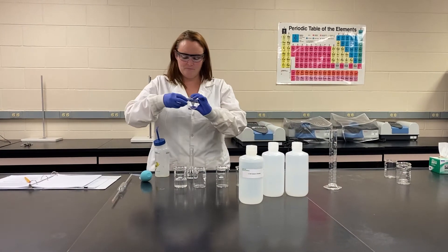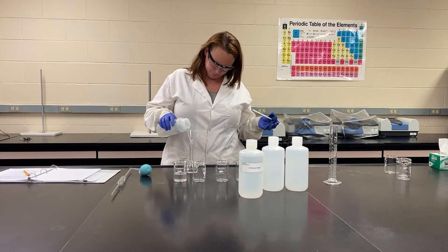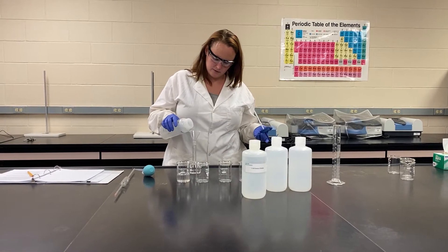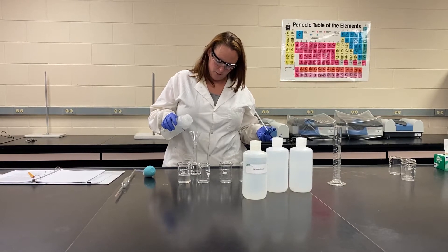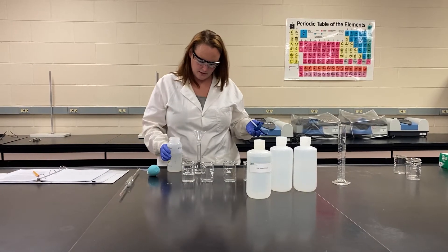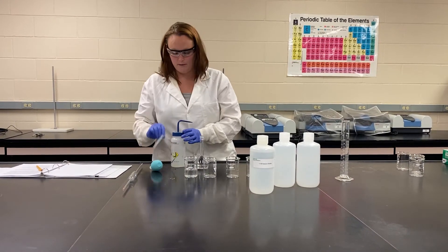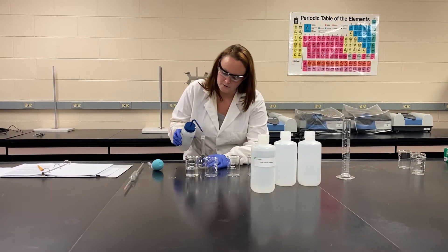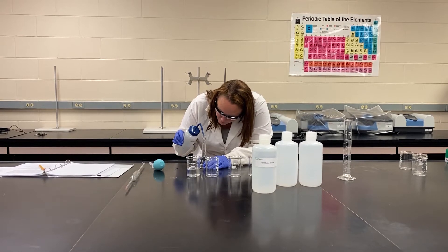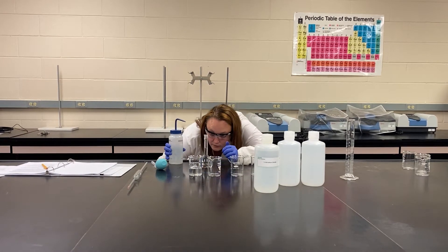We use a funnel to add the water. Be careful — I always stop when it reaches the neck so I don't overfill it, because some of the water actually fills into the funnel and we don't want to overfill. So I've reached the neck, so I'm going to go ahead and stop that. Then you can either use a pipette or the tip of the squirt bottle, and you're adding water until the bottom of the meniscus reaches the indicating line.